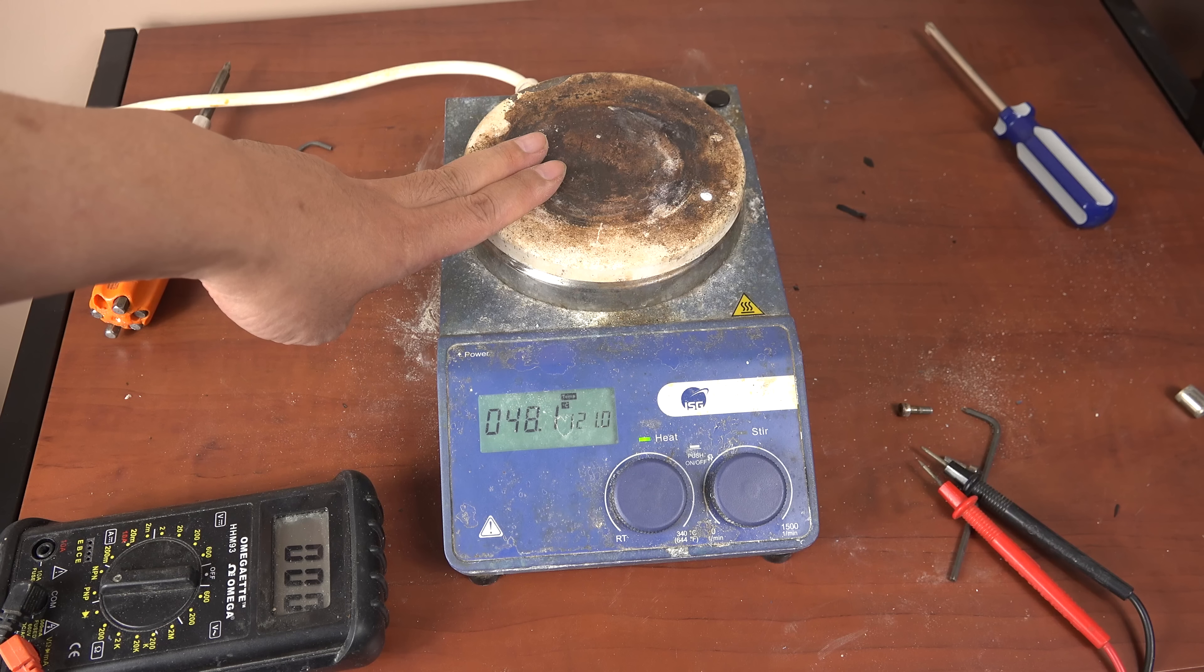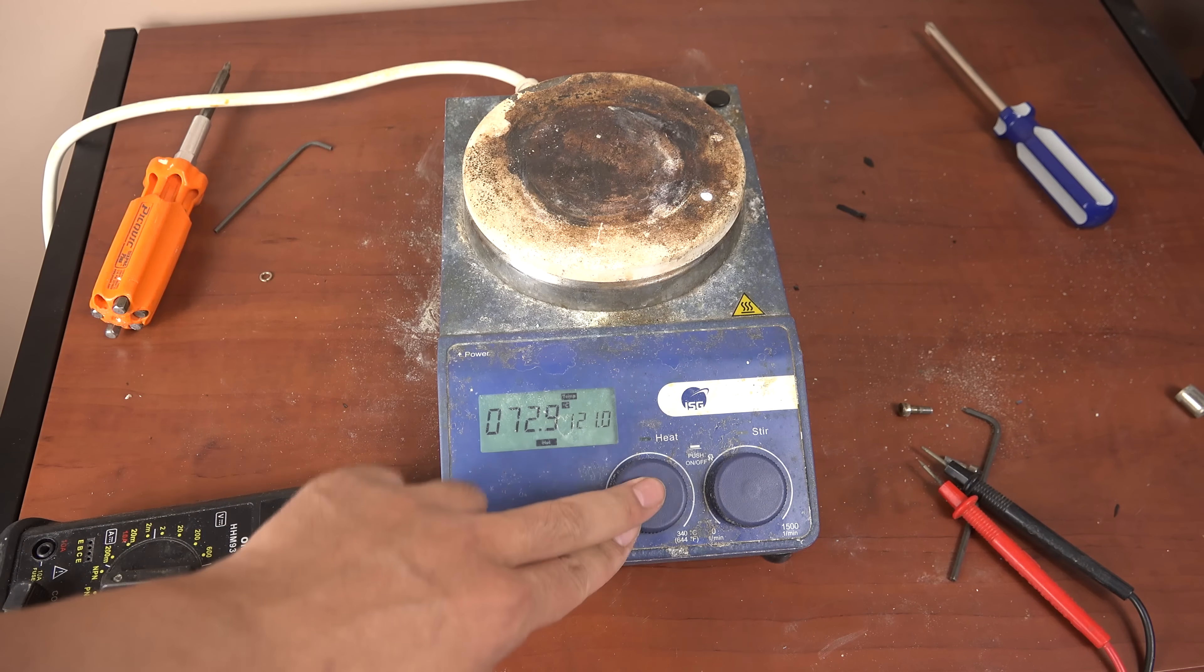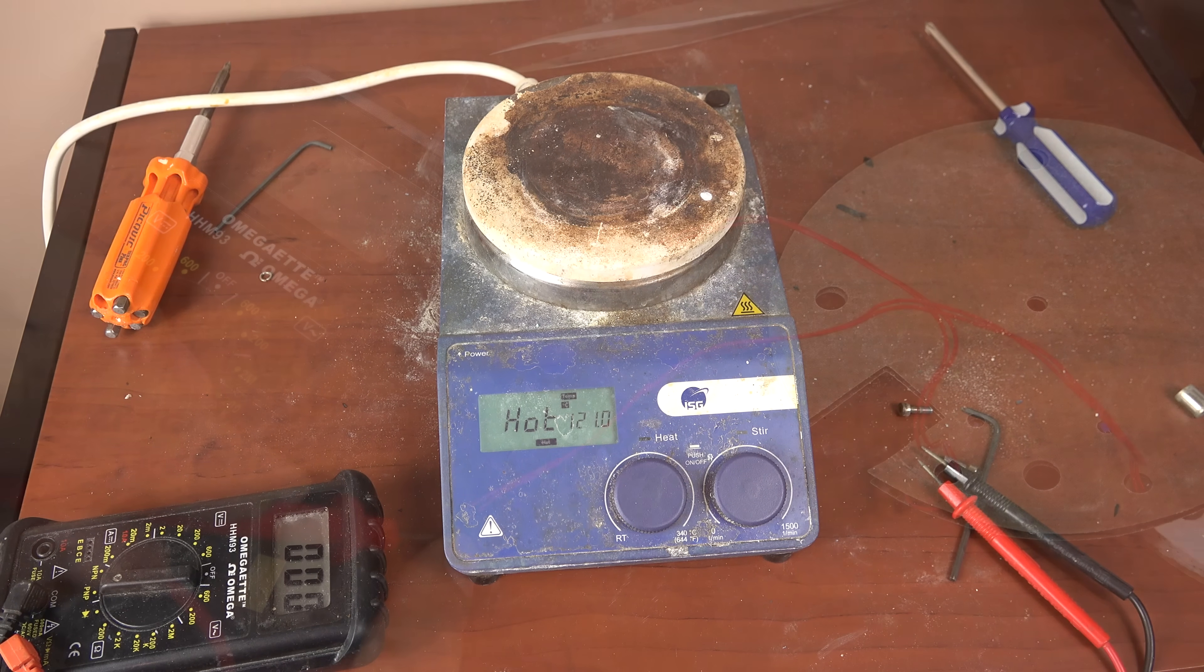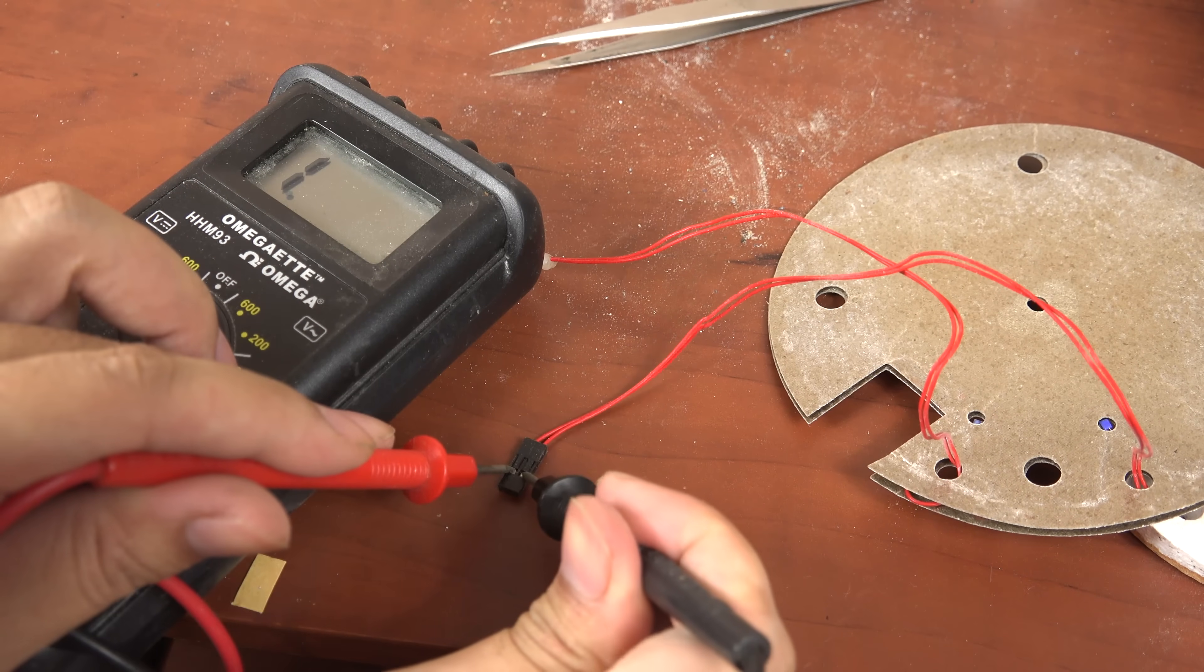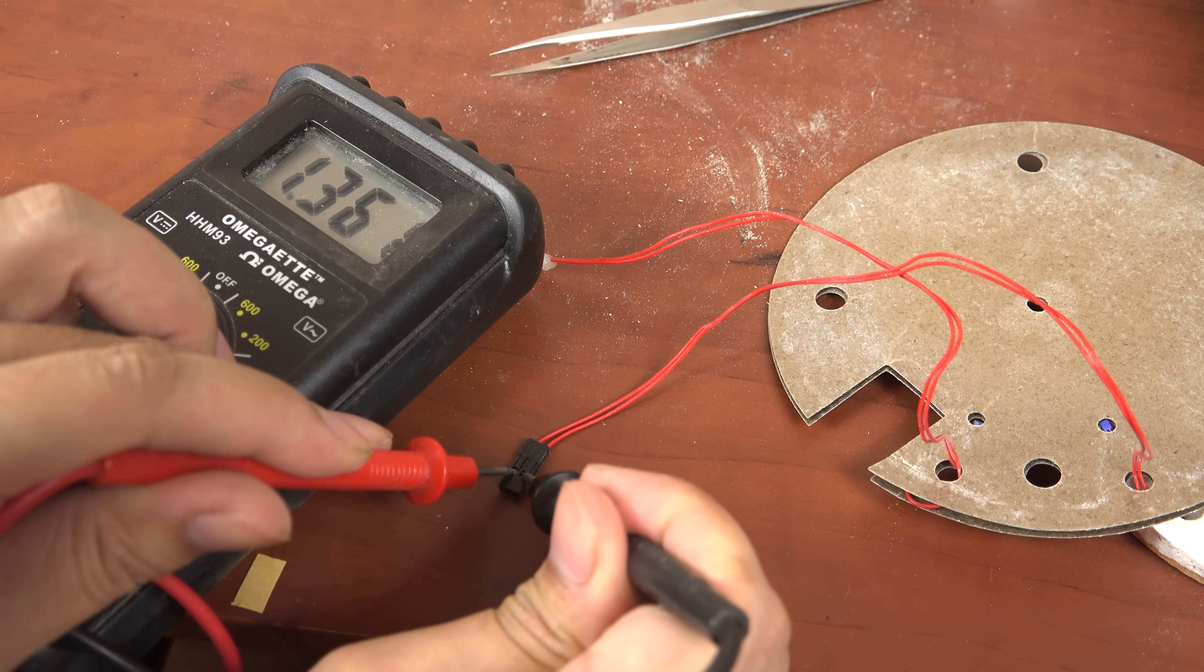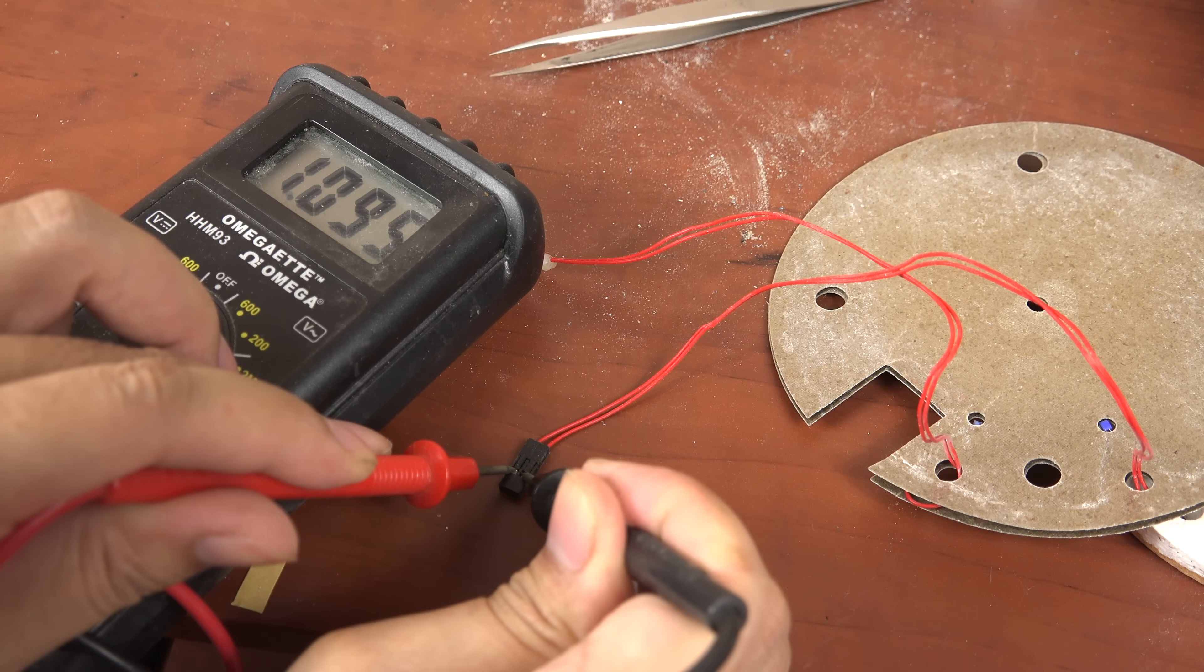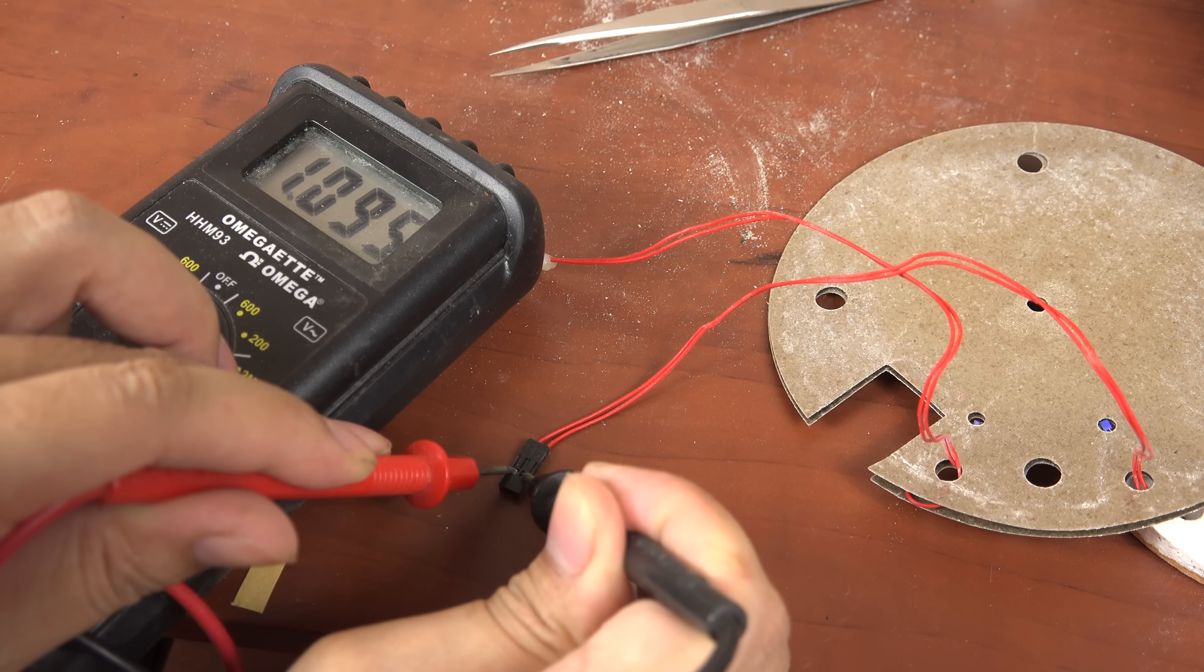It looks like the hot plate is back in service. Now I'm not going to complain about quality this time because it was working for several years before finally failing. With the kind of abuse I put these plates through, I can't really expect more than that. But at least it was easy to fix and didn't require that I contract out a specially made part like the heating elements. So I'm happy with the result. Hopefully I can get back to making more videos.